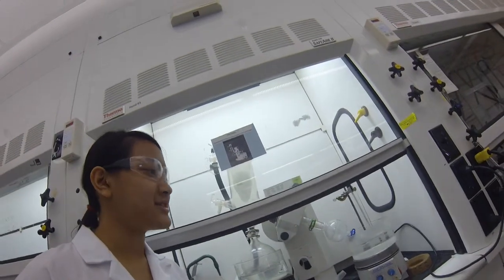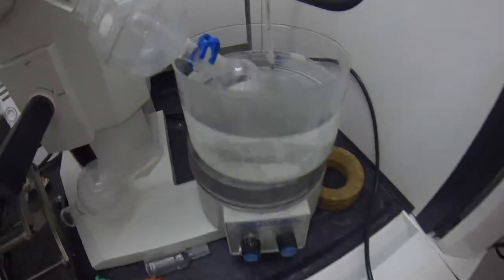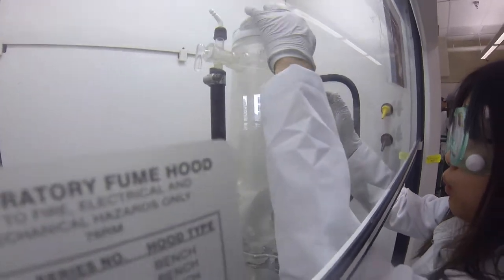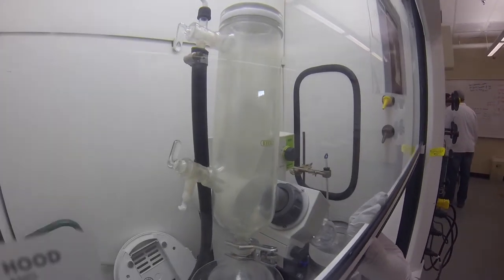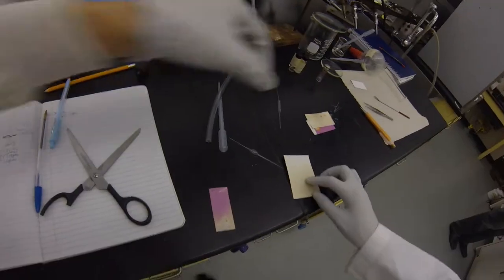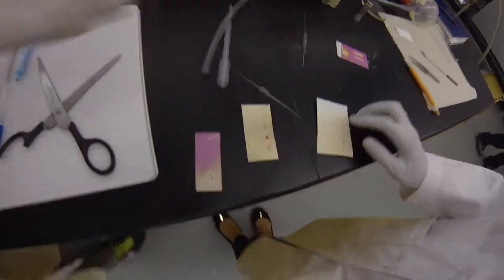What are you doing today? So we are roto-vapping our... What is that? Do you want them in the video? Let's get a look at that one. Look at it. Look at how pretty this is. Bam.